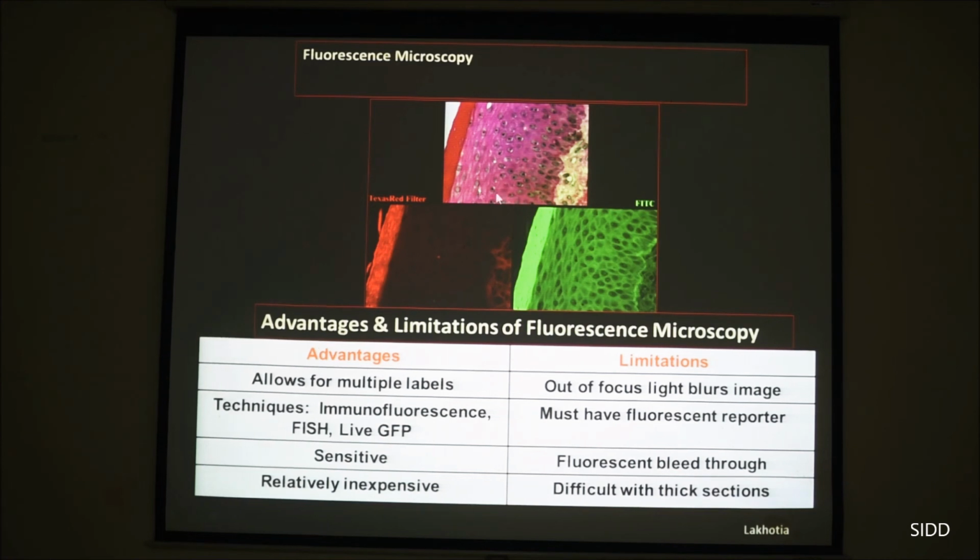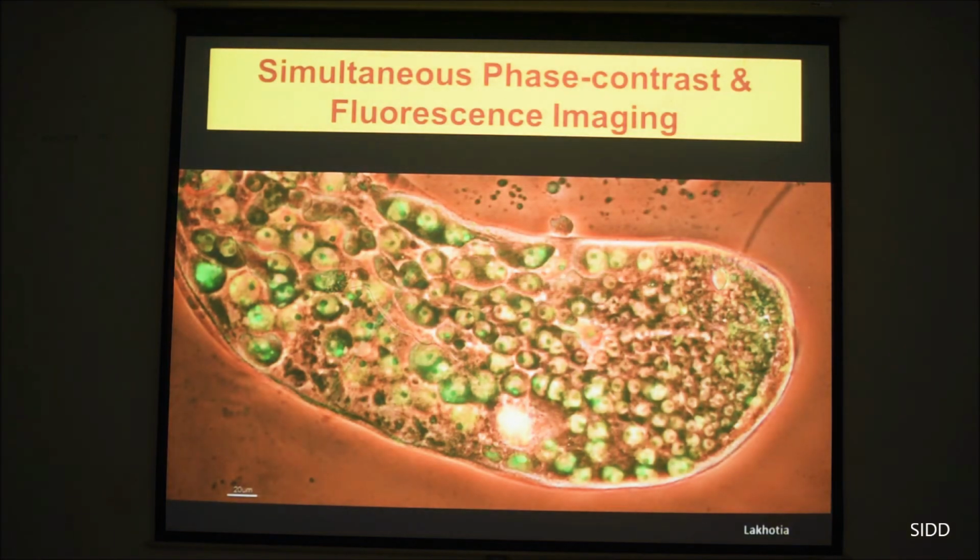So with fluorescence, there are various kinds of fluorochromes that can give you some natural molecule that binds with all proteins or certain specific proteins, or what is most commonly used now is antibodies. Antibodies are tagged with a specific fluorochrome, so that where the antibody binds to the antigen, you will get that fluorescence property tagged to that.